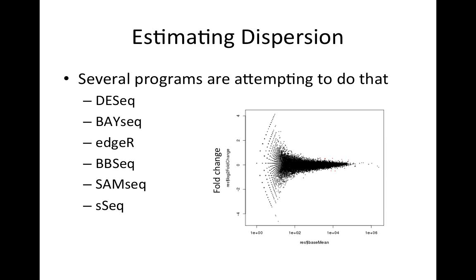So what they're trying to do is, if this is the graph of 2 replicates against each other, you expect some noise down here, but you of course want to know what your real differential expression looks like, which will be up here or down here. So all of these programs over here are attempting to draw basically a line where your natural variability is, so that if there's anything outside of natural variability, that's what's called as differentially expressed.